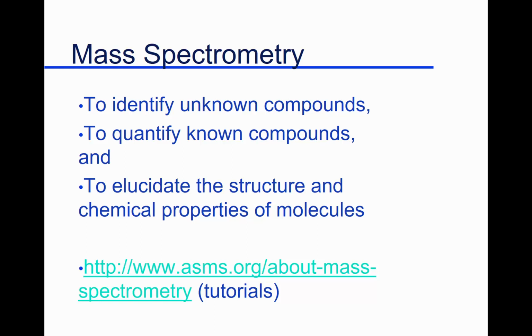Okay. Well, good. We're going to move on to mass spectrometry. Well, what's its purpose? We'll start off with why do we use it, its value. Well, primarily to identify unknown compounds. That's what it's really, really good at, identifying compounds when we don't know their identity.